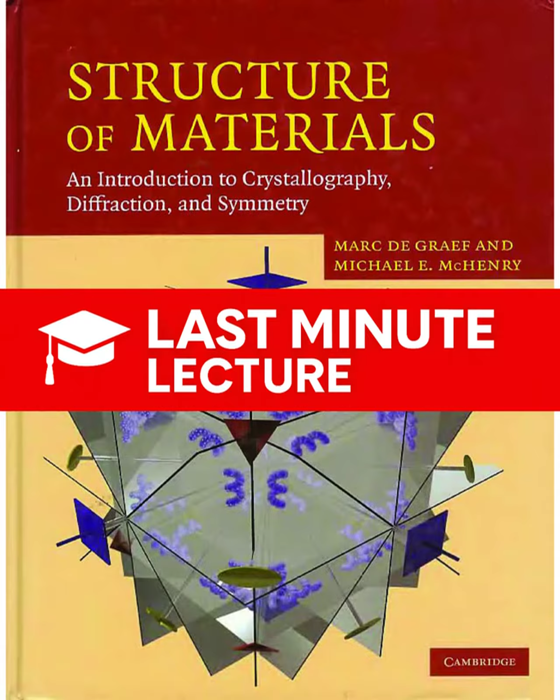Bragg's law only tells you if a reflection exists at a specific angle for a single plane. To map the entire 3D reciprocal lattice, we need a geometric tool. And that tool is the Ewald sphere, a conceptually beautiful construction from Paul Ewald. Okay, let's establish the geometry.